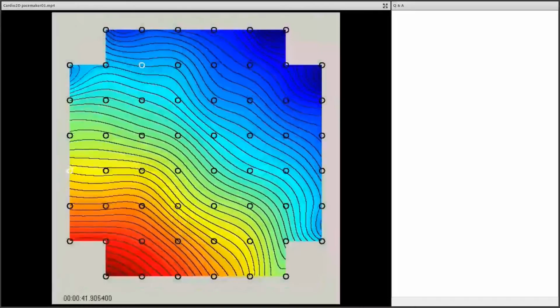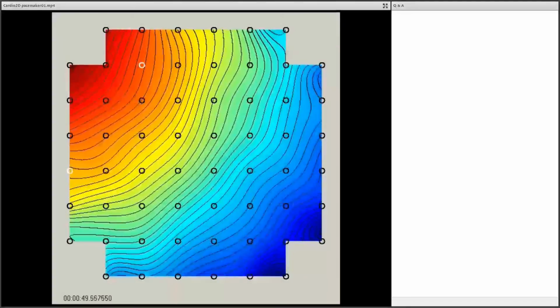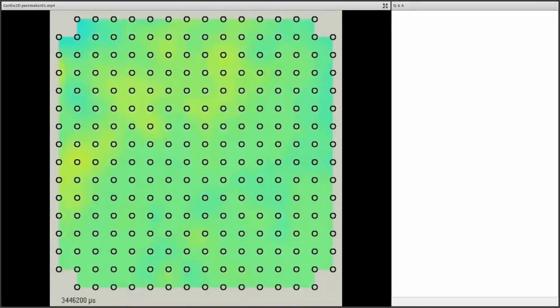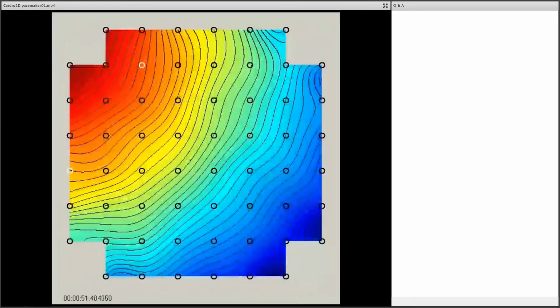And what you saw here is, in false color display, the starting point of the excitation of the cardiomyocytes, and here on the second video, how it is switching from the lower left to the upper left, the excitation pattern going from one corner towards the other over the cardiomyocytes. As said before, there are going to be special webinars on that software too. Therefore, please check out our website for that.